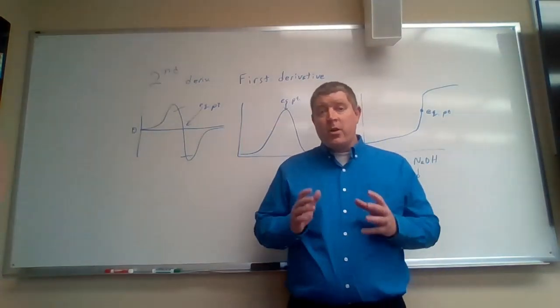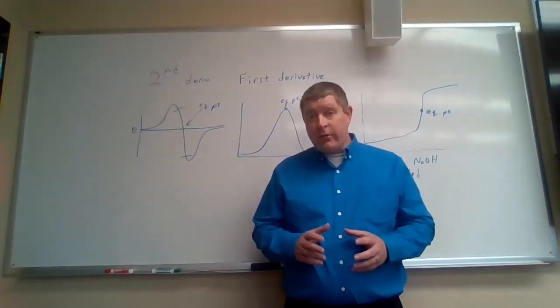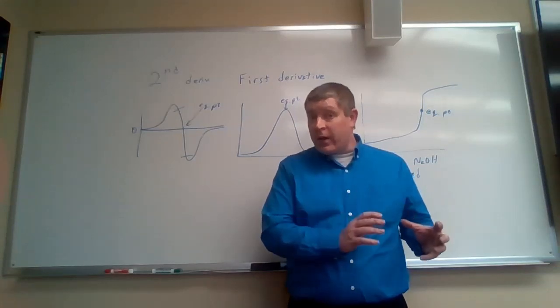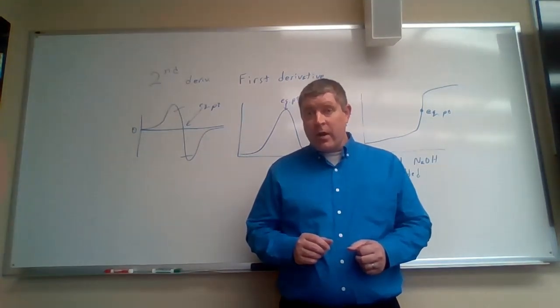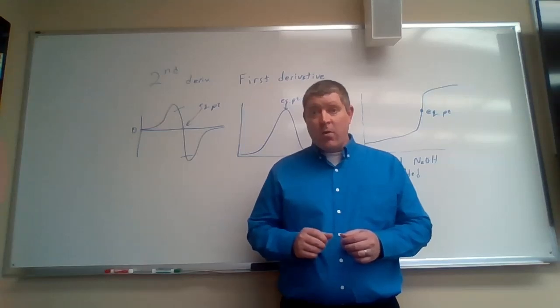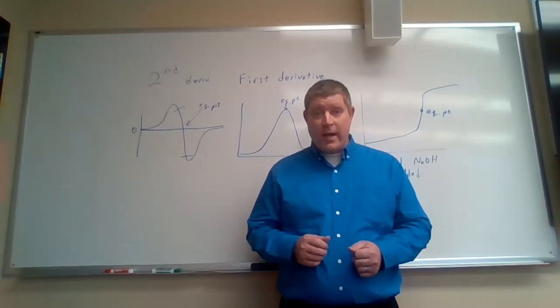In this experiment, you are going to create a solution of sodium hydroxide that you are then going to standardize to identify the concentration of, and then you're going to use that solution and its concentration in the next few labs. So make sure that you label that solution. You'll have a storage bottle to store it in. Make sure you put a label on it with the concentration and your name or initials, and store it in your lab drawer or cabinet for the next few labs.